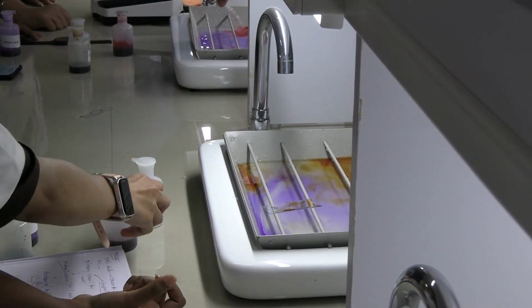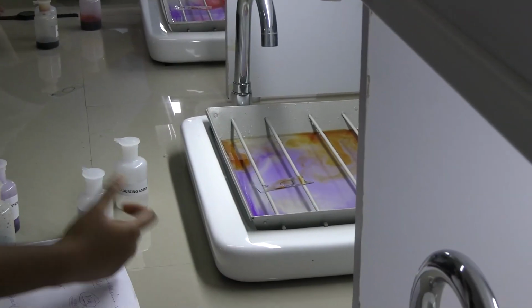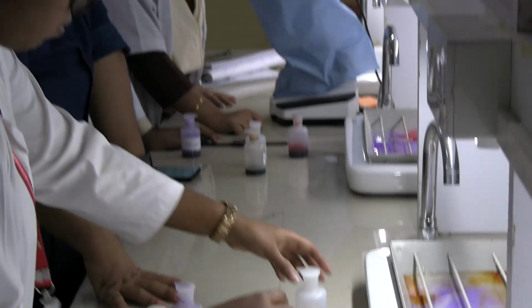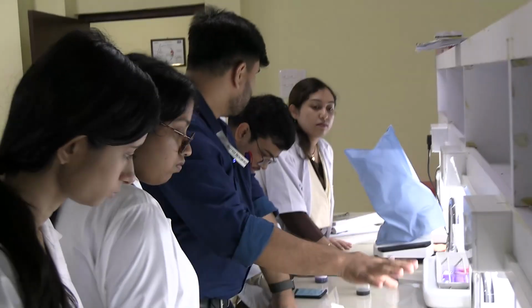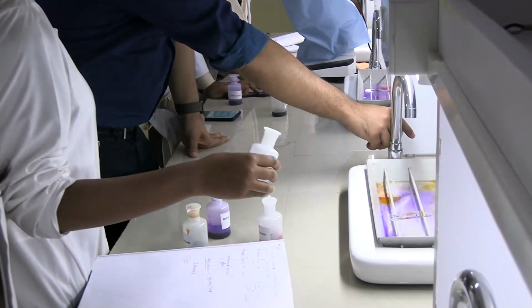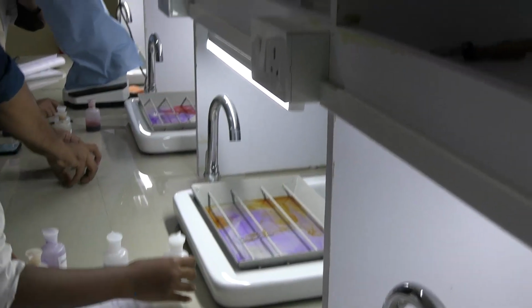Then acetone. Remember, acetone we have to give it for 2 to 3 seconds. But 2 to 3 seconds is so little time that you don't get enough time to make it wet on the slide. So you're gonna put the acetone and you're gonna quickly wash it under the sink. Same way. Wet. You are again doing it wrong.